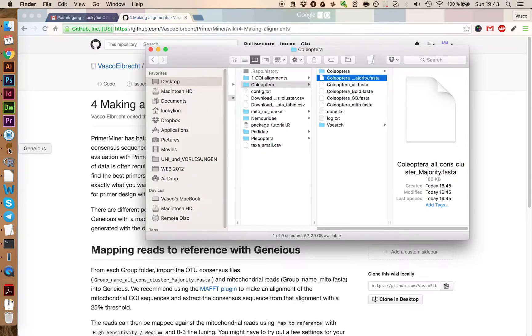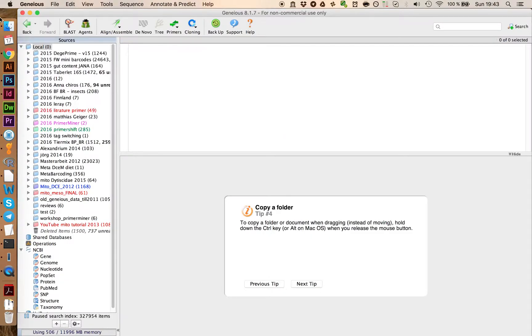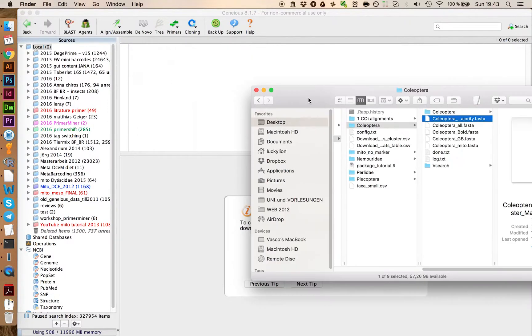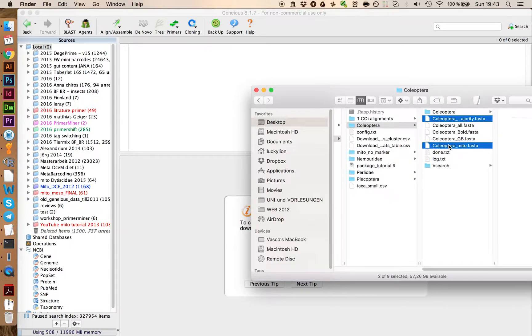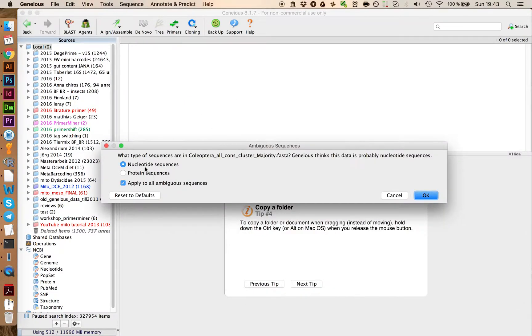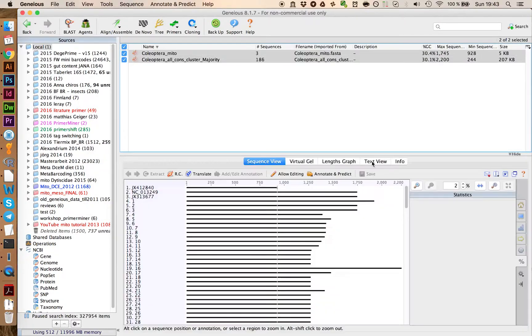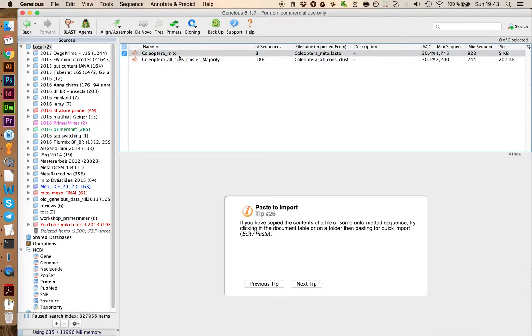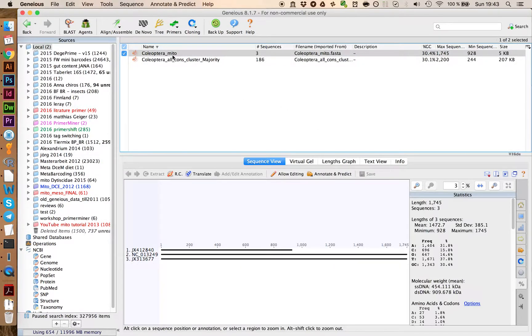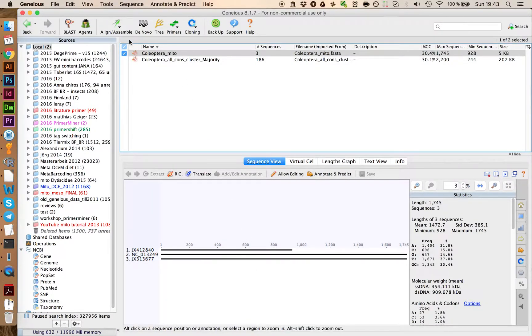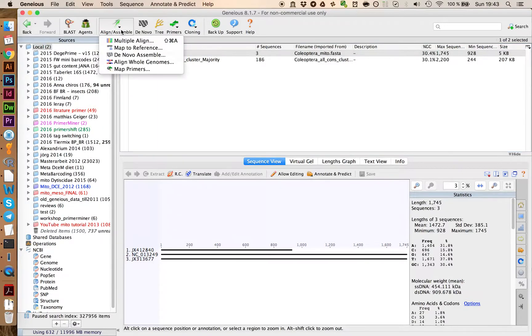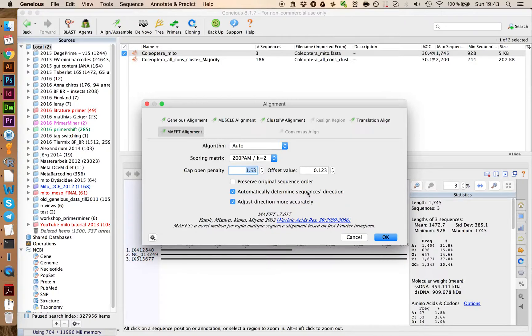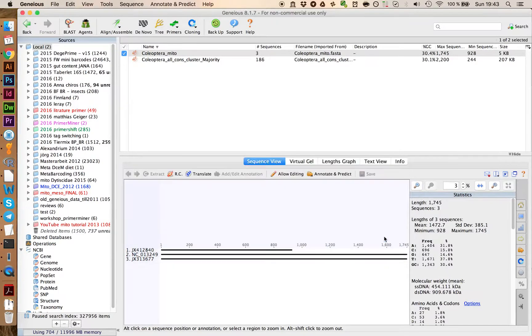So let's open up Geneious, and in here we can import these two files per drag and drop. It asks us if those are nucleotide sequences, and we say yes, they are. And you can select the Coleoptera mito file, which are the CO1 sequences from the mitochondrial genomes, and we go on Align Assemble, Multiple Align, and align those with the MAFFT Alignment tool on the full settings.